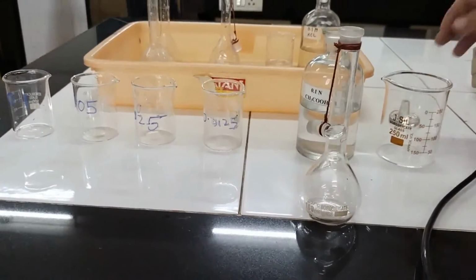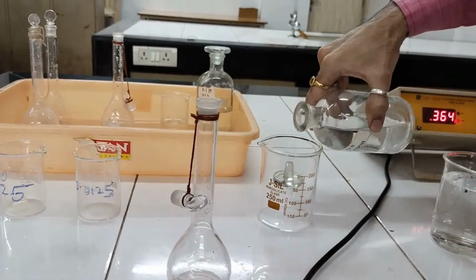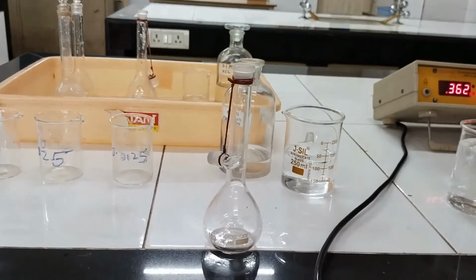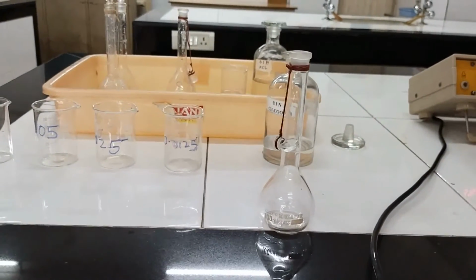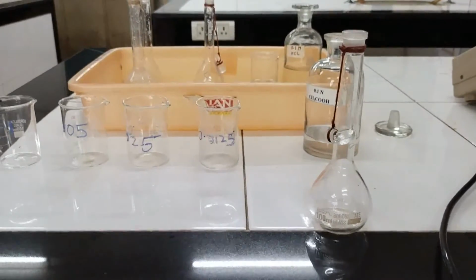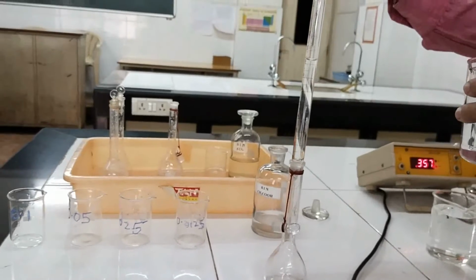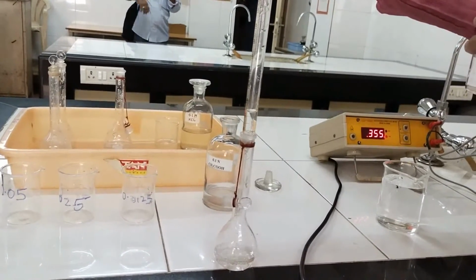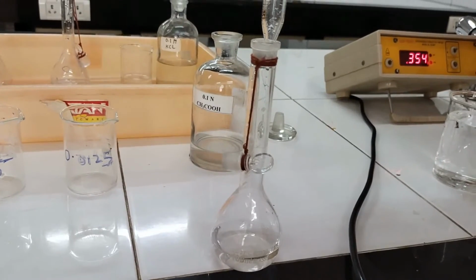First of all, the pipette cannot be directly inserted into the stock bottle. So we transfer some of the 0.1 normal acetic acid solution into this beaker, and then since this is a 25 ml pipette, I have to pipette out twice. So this is the first time. This is 25 ml. You go for the second time.